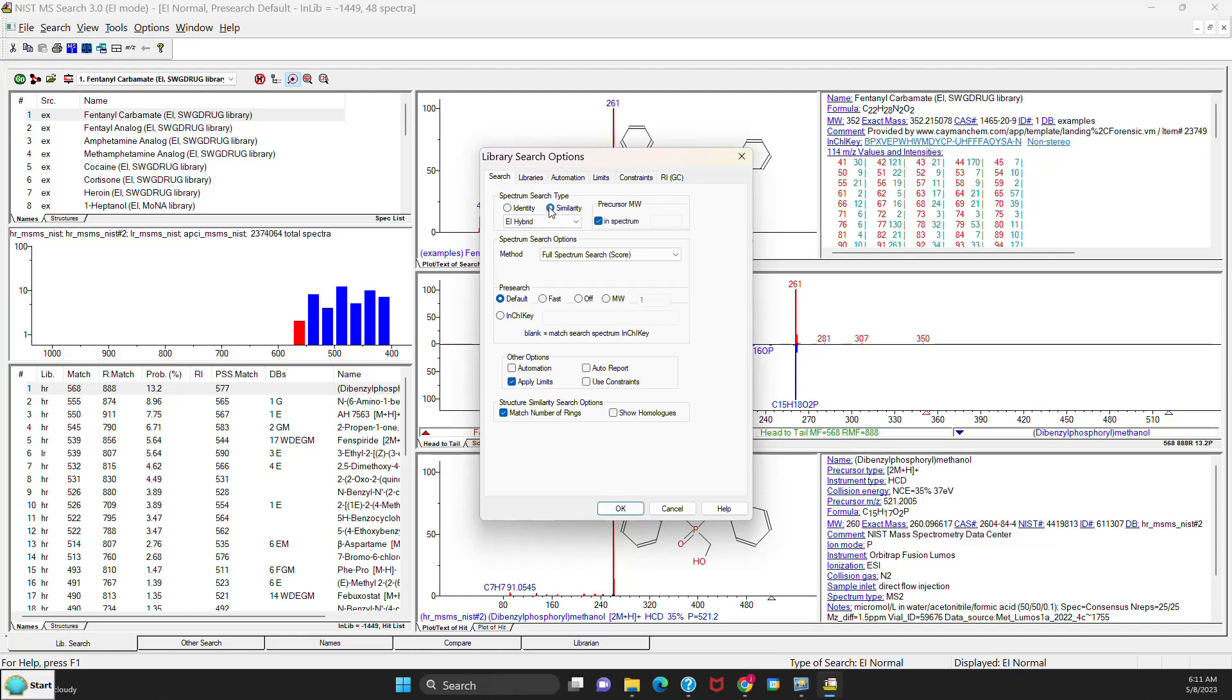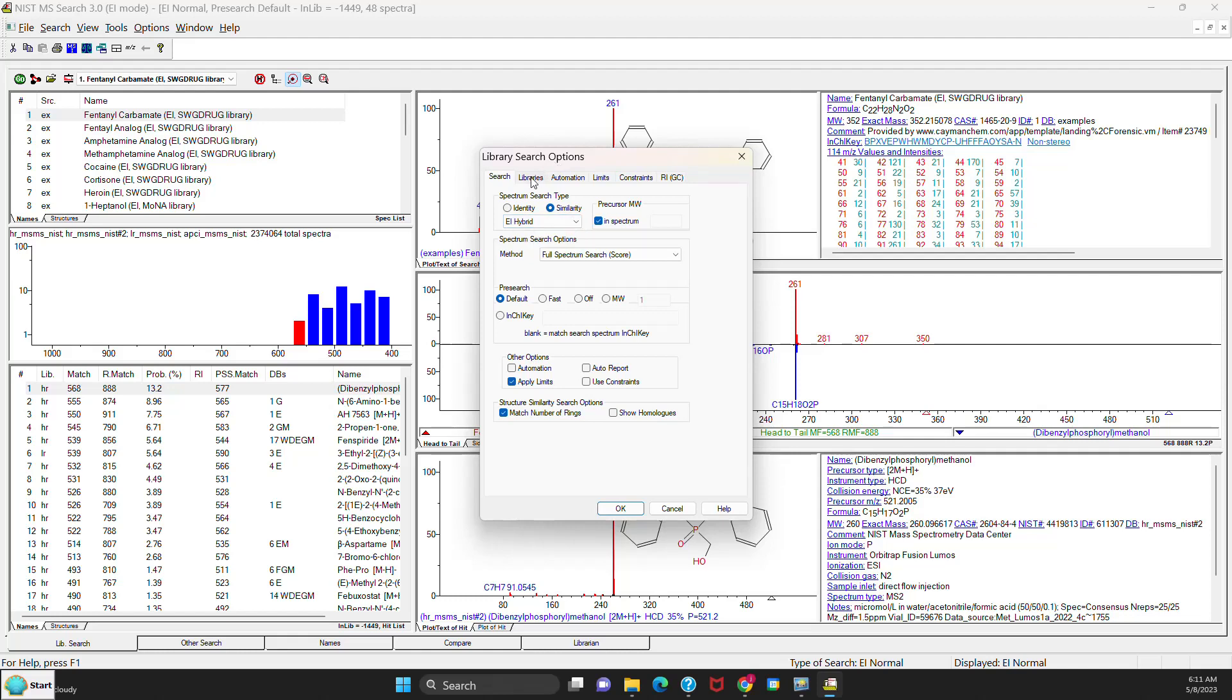Also, if you go to the Similarity, you'll only see those for the EI Hybrid, the Simple, and the EI Neutral Loss. So none of the MS-MS or Tandem options. And if you look at the top on one of the tabs, the MS-MS tab is no longer there because you don't need it for doing EI analysis.